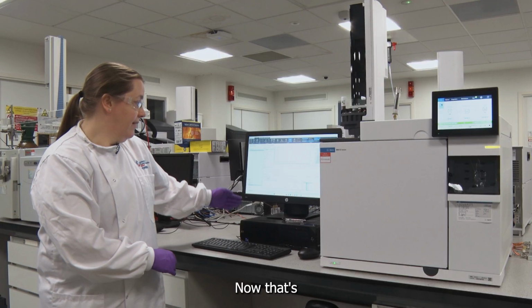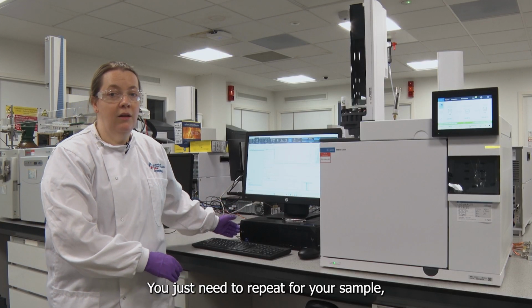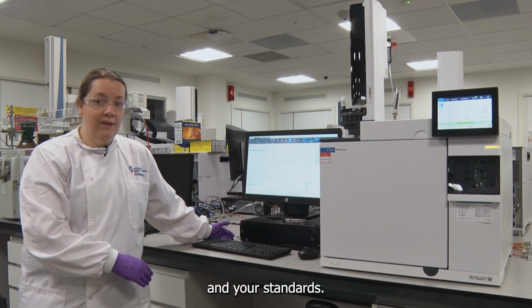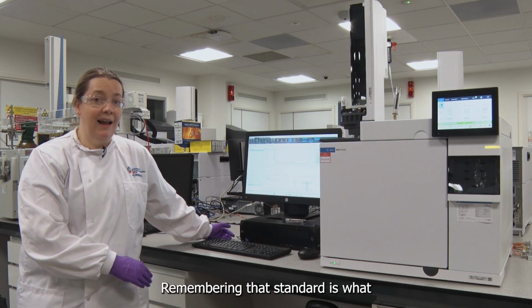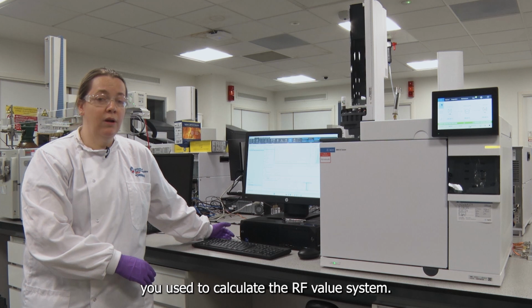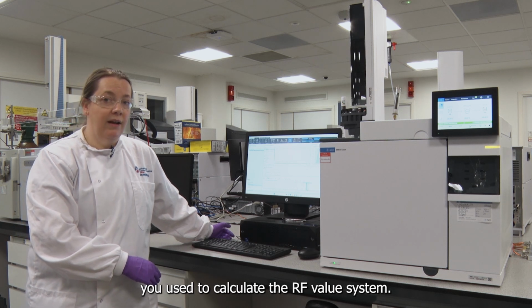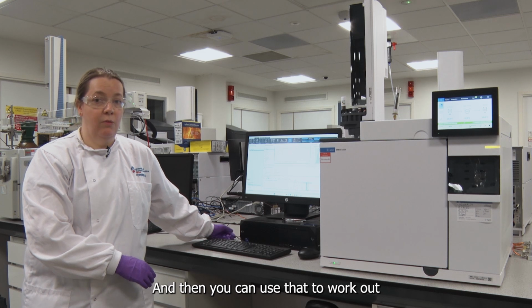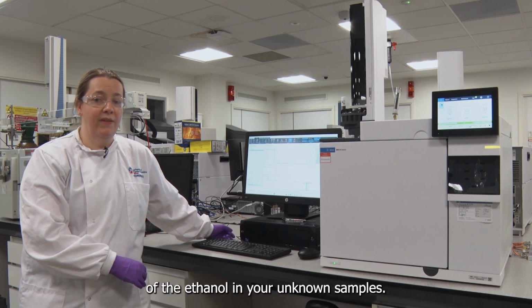Now, that's how you do the run for the blank. You just need to repeat your sample and your standards, remembering that standard is what you use to calculate the RF value, and then you can use that to work out the concentrations of the ethanol in your unknown samples.